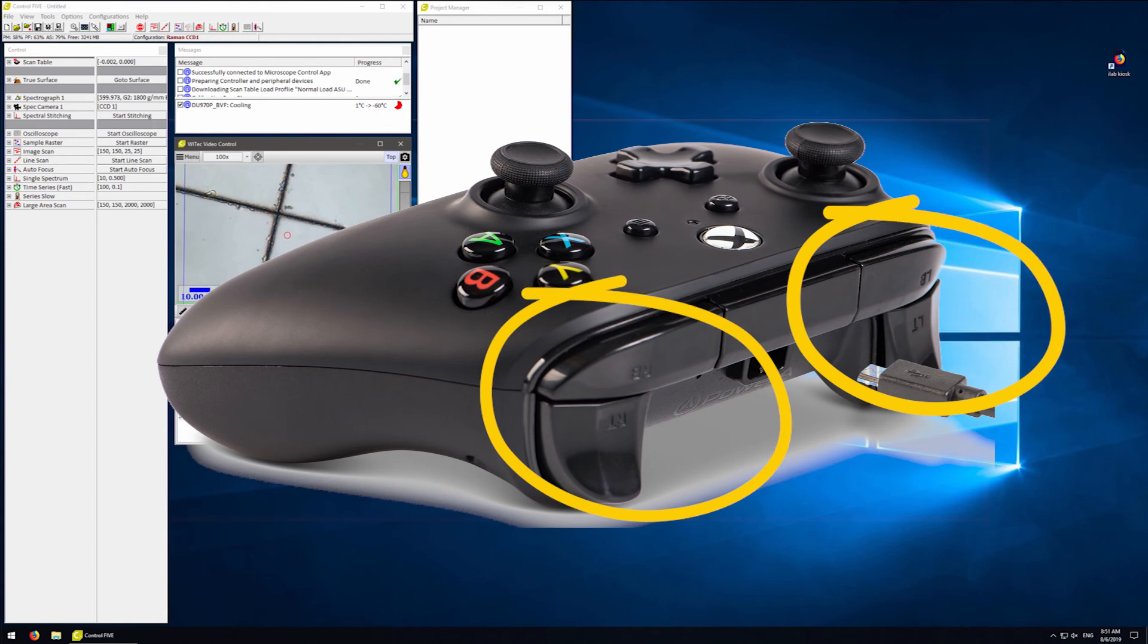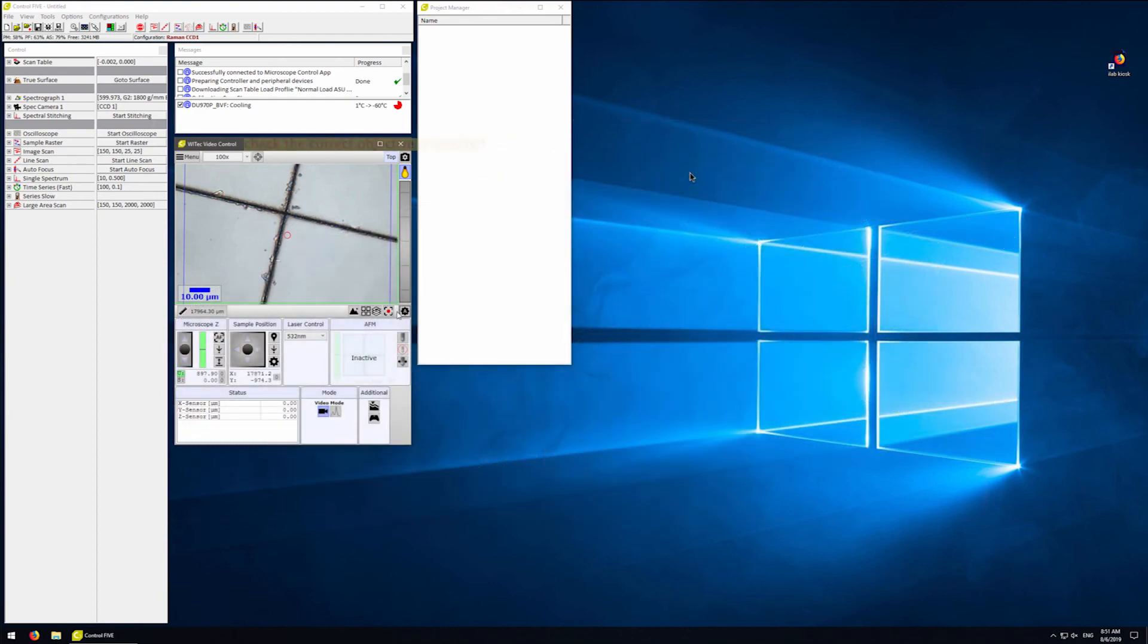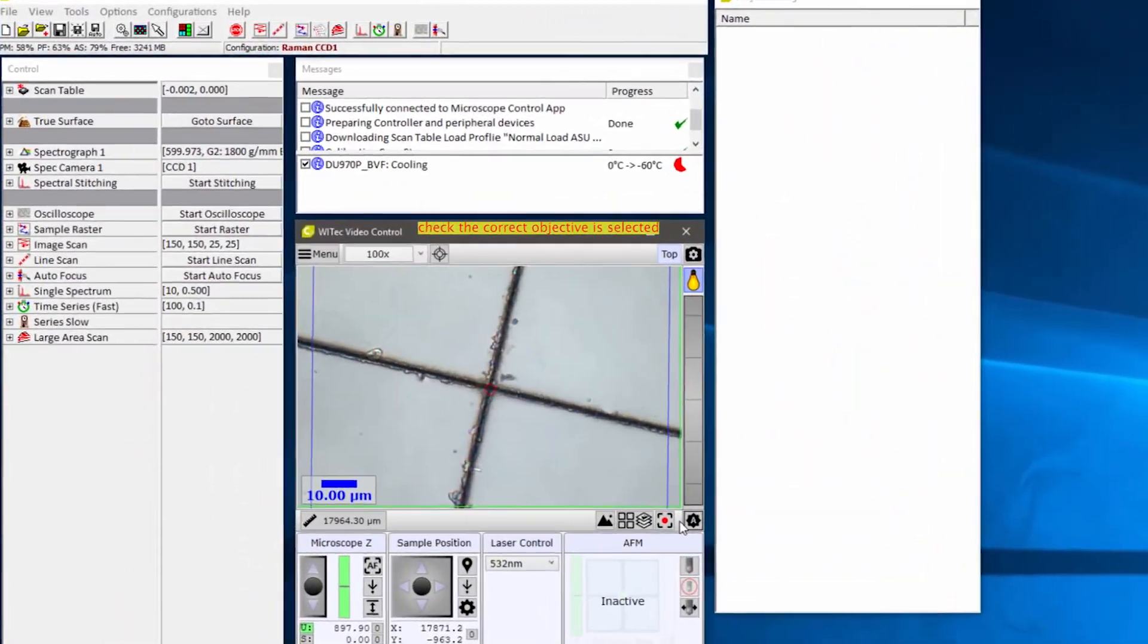The top one will go very fast. The lower one has a speed controlled by the magnification of the objective. You may have to adjust what objective you're using.